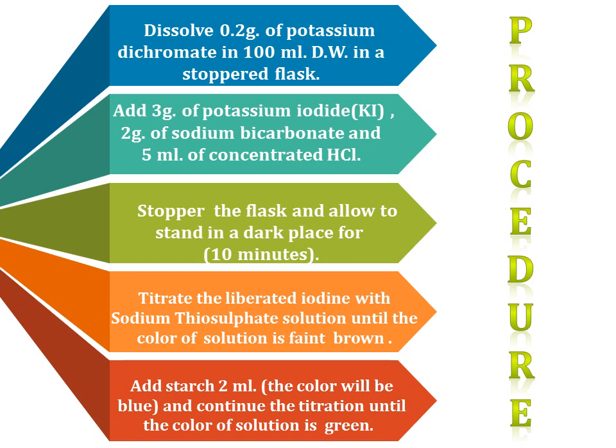The produced iodine is insoluble in water.